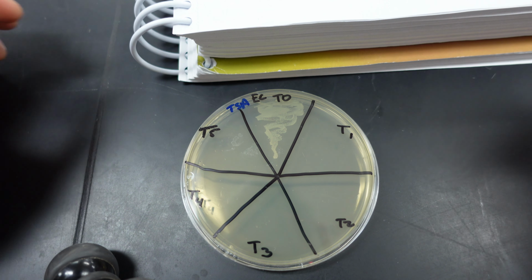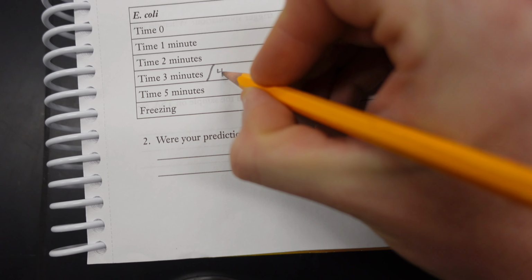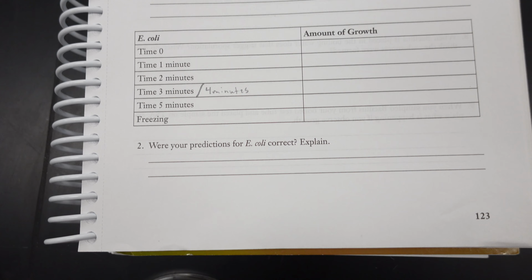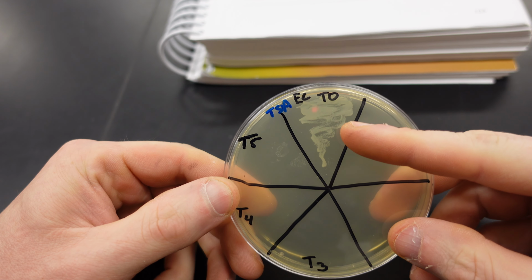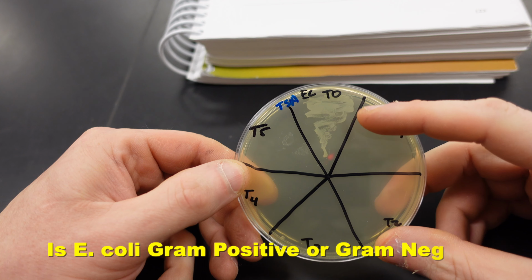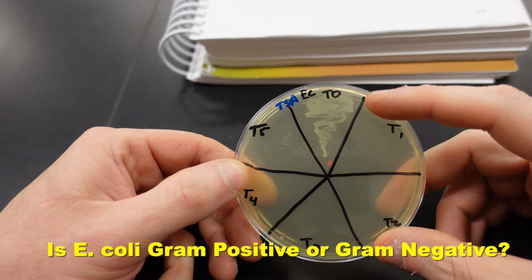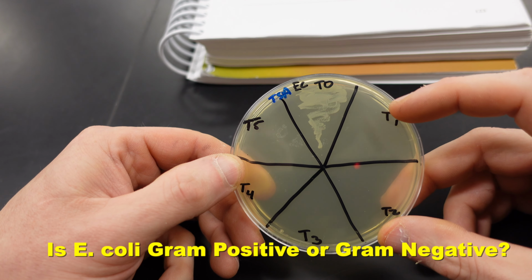E. coli. So here we just went from 1, 2, 3, we'll do 4 minutes and 5 minutes. And here we can see that E. coli, we have our time 0, and after 1 minute in the boiling water, it's dead. So the vegetative cells are quickly killed by the boiling temperatures. E. coli does not form endospores, so it is quickly killed by the boiling temperatures.